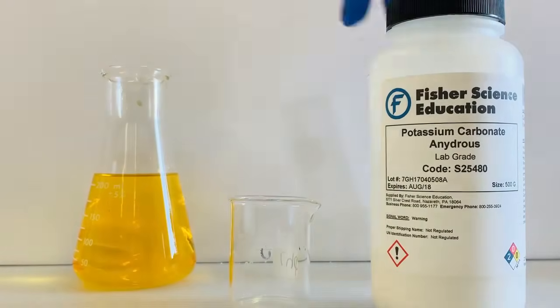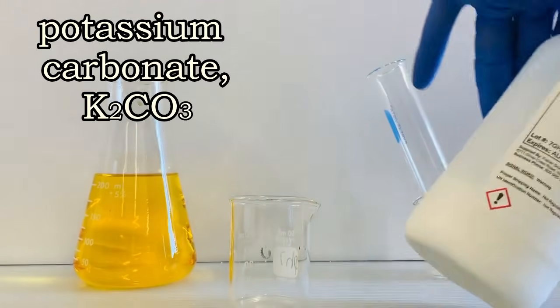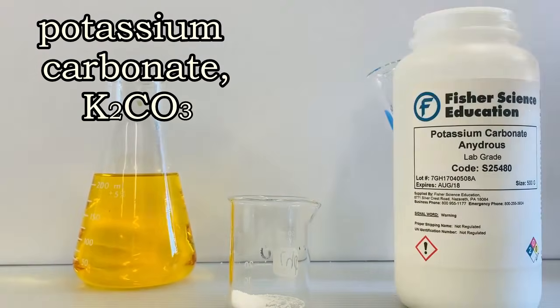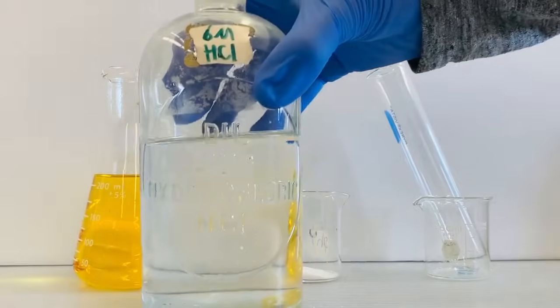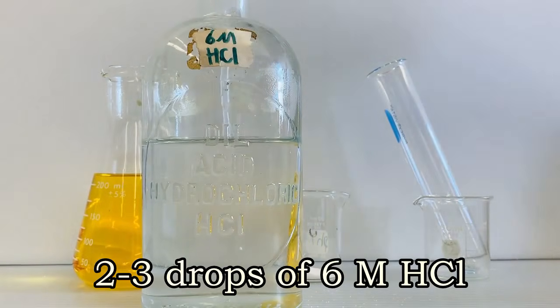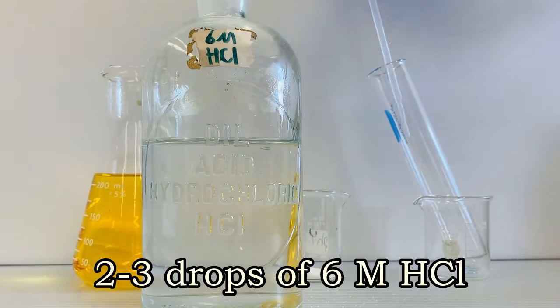A white solid called potassium carbonate is added to the beaker. Potassium carbonate is a basic salt. Finally, two to three drops of six molar hydrochloric acid are added to the test tube.